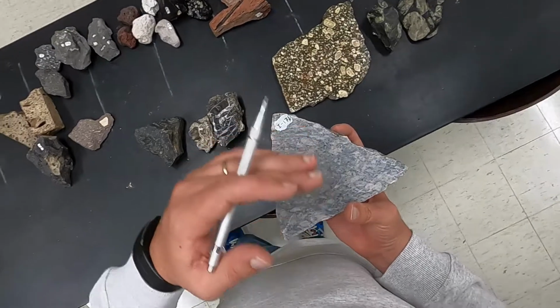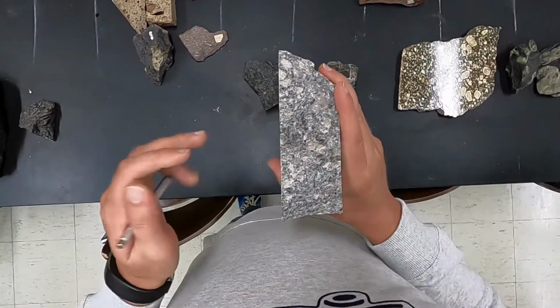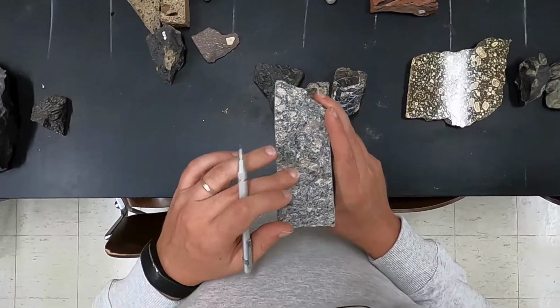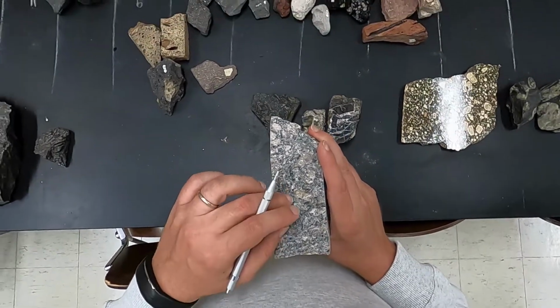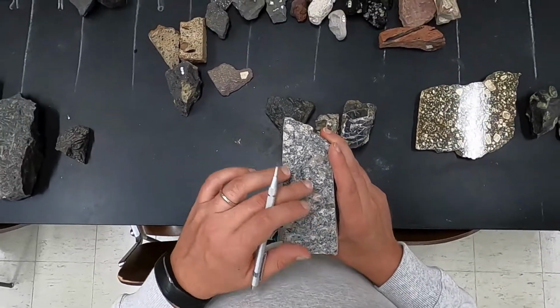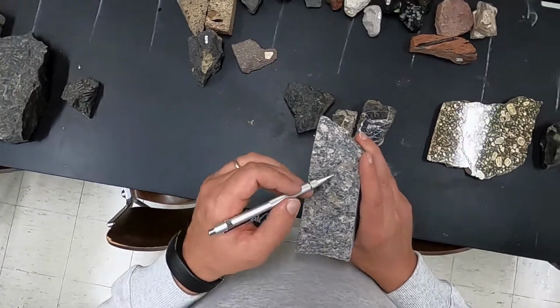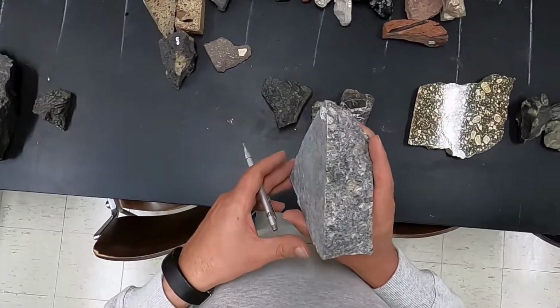So something has deposited, and in particular in this case, based on what we see, we have a lot of silica, we have very tiny microcrystalline fragments that could be cinerites, and then we have these larger clasts that are either siliceous or feldspar rich in terms of composition.